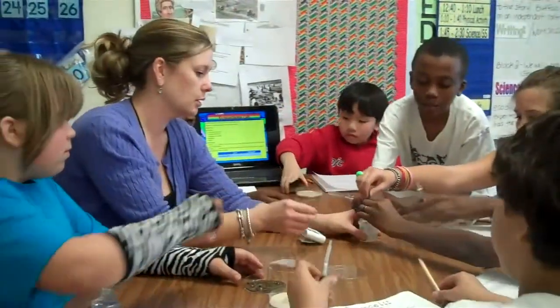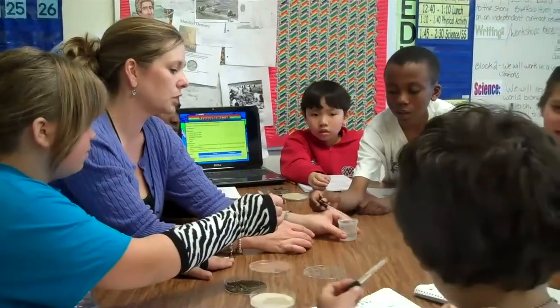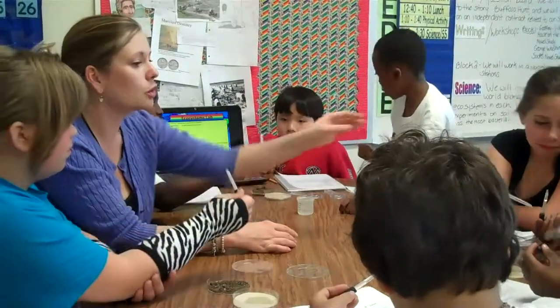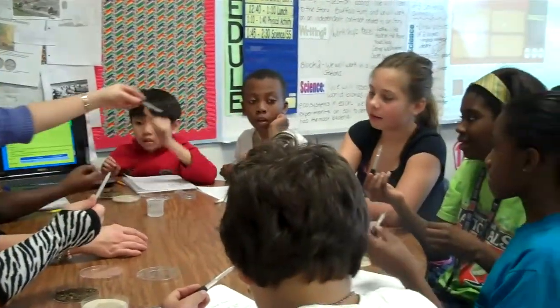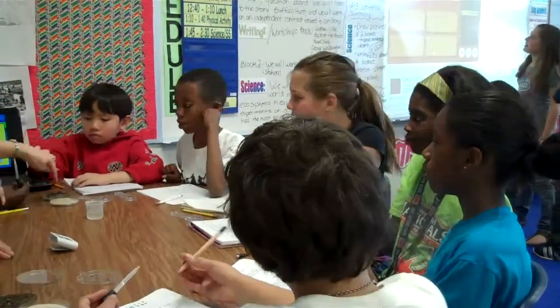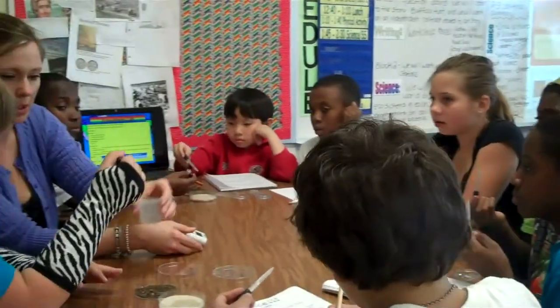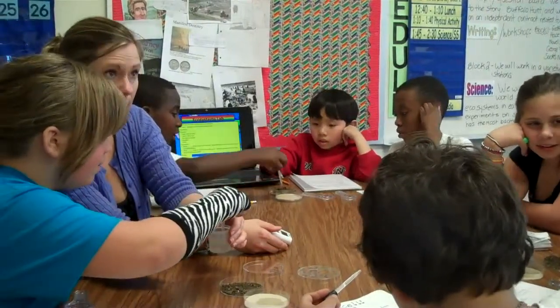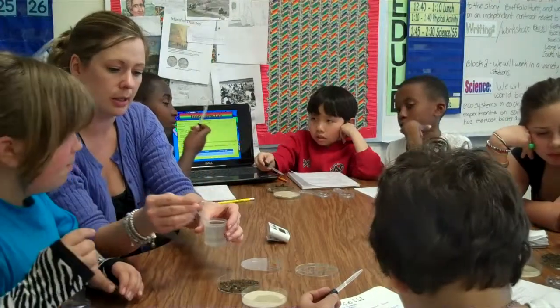12 drops. Or so. I'll do it together, and I'm going to push the timer so we time for the same amount. All right. Hang on. Girls, can we have 2 of the droppers? Can we have 2? And then you'll be able to add more. But they only have 2. Did you get to drop some in last time? Yeah. Okay. Let's wait for Jordan to get some peroxide. Wait, hold on. Squeeze. There you go. Oh, let's get a little bit more. Squeeze it. Suck up. There.